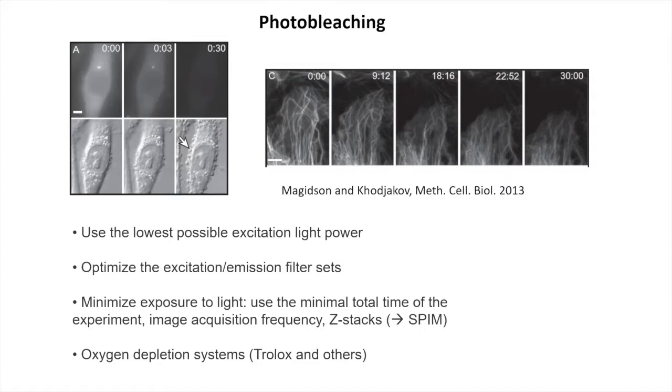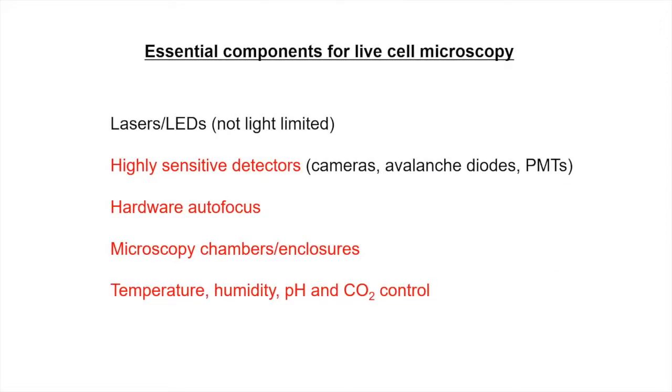Arguably, this may or may not help, but one has to optimize the conditions depending on fluorophore and applications. So again, poor signal to noise ratio, that's the background ratio as a result, because you have to be very careful how much excitation light you use. That's a challenge, and you have to optimize, make sure the cells are fluorescent, etc.